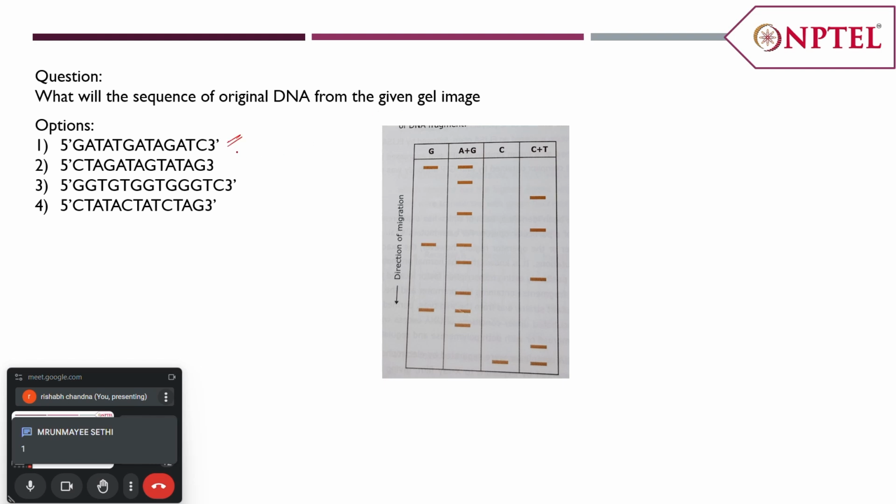Okay. So in case of the Maxam-Gilbert method, it is not the complementary sequence.